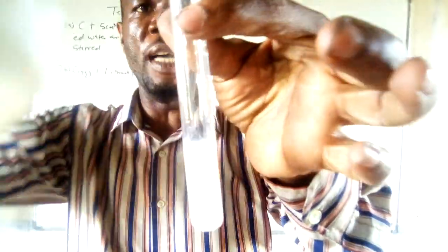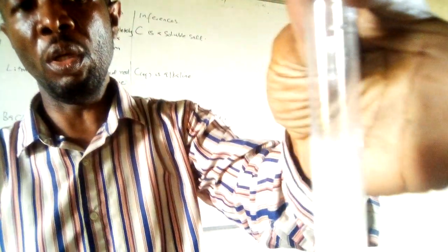So you can see what happened. A white precipitate has been formed inside. You can see some solid inside. White precipitate formed.